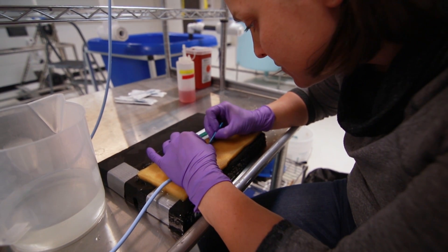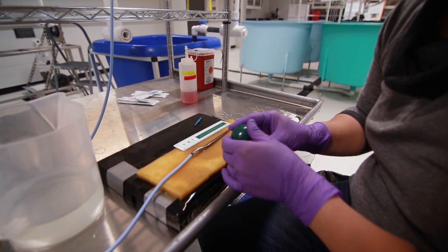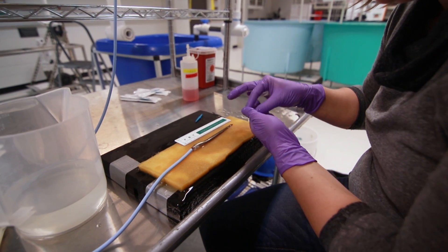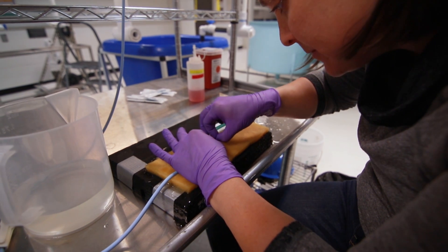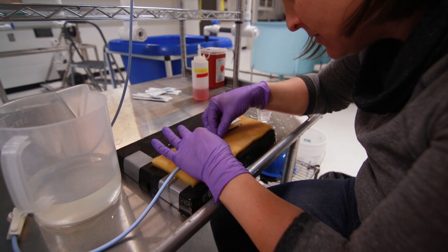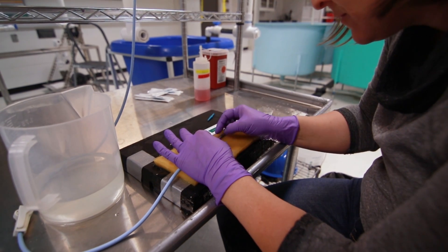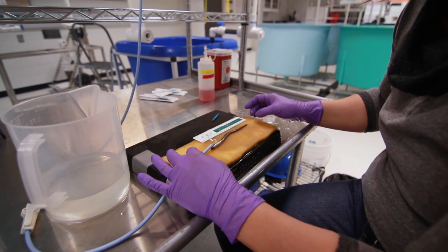This is the location that we've determined is the best for juvenile lamprey based on their anatomy and biology. I'm just going to insert the tag into the body cavity of the fish through that incision. This tag doesn't require any sutures to close it, so that incision will start to heal over pretty quickly for the fish.